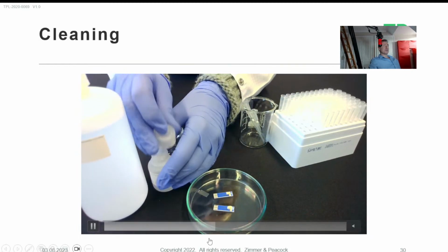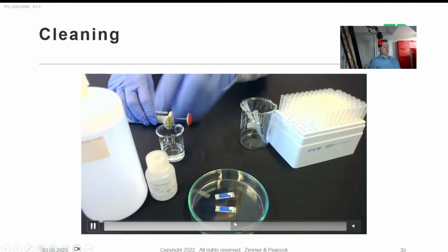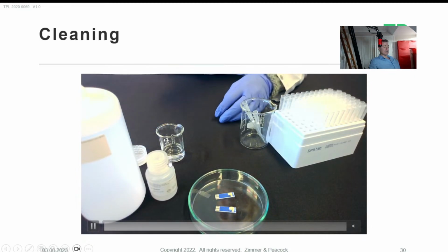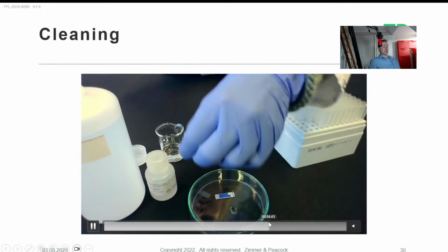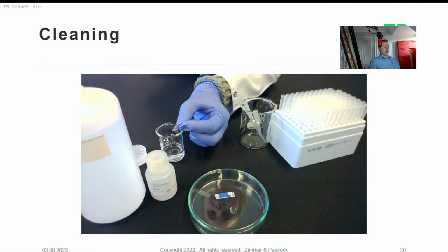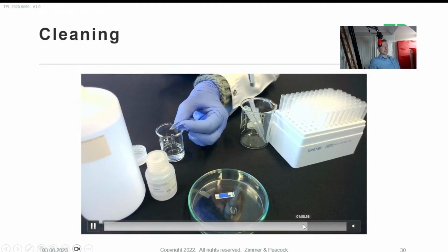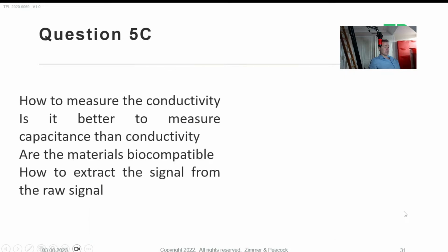So this is really the sort of optimization that people need to do as well. But I'd leave that on there for 30 seconds. I don't want to say what she says in the video, but I was just watching along and it was approximately 30 seconds. She then gets out a bit of a rinse solution, and she just starts rinsing it off a few times. So it's not super rocket science as to what we're doing, and I would honestly just follow the video. 50 microliters is fine for the cleaning and the wash steps, and you can see she does quite a few wash steps there as well. So seriously, just follow along with the video and you should be fine.